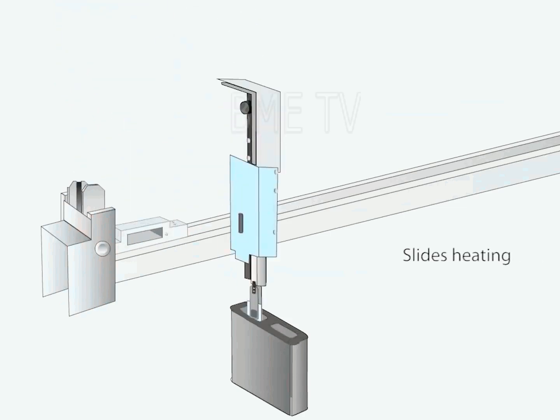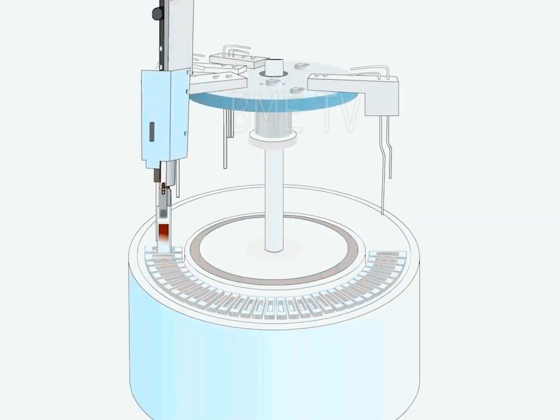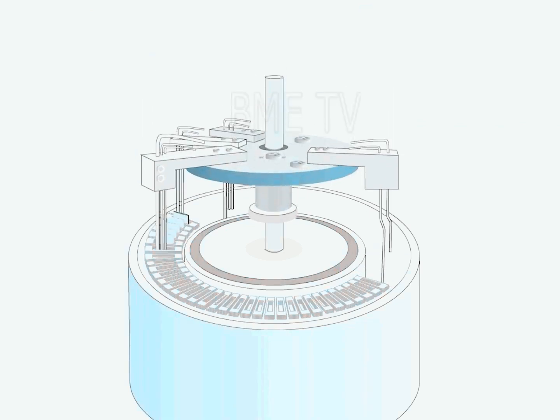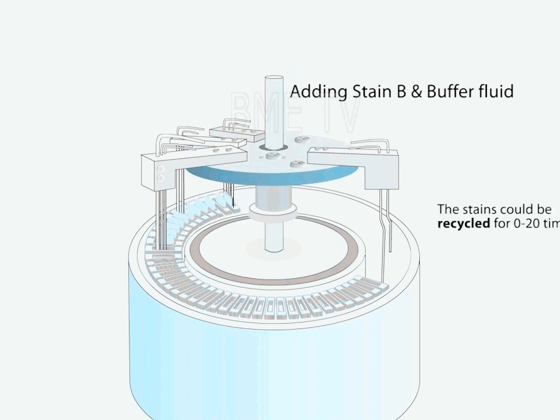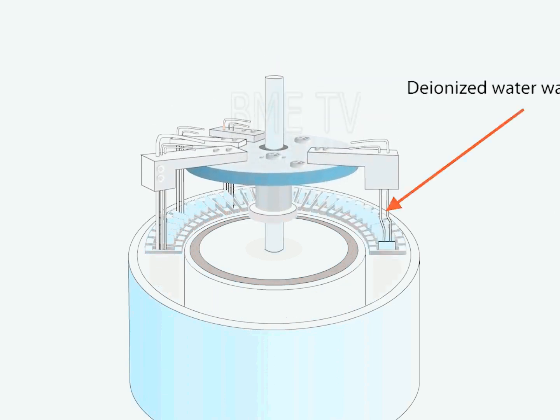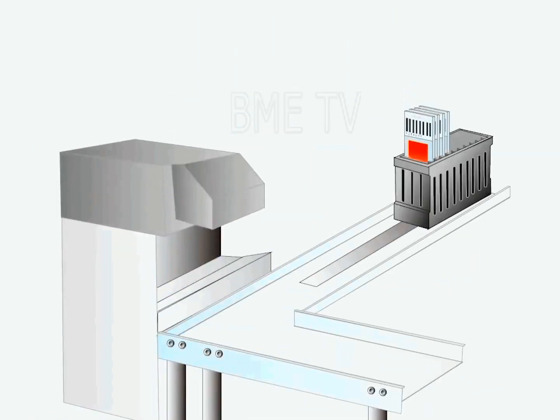that reagents are applied to individual slides in small, controlled volumes, rather than fully immersing slides in a large volume of reagent. This is necessary because the chemical reactions involved in non-routine staining protocols are far more sensitive and often require that a series of reagents be applied in a specific order to create bound molecular complexes.